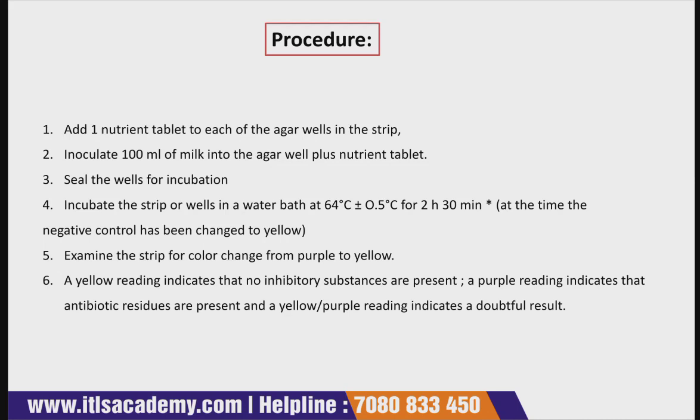Then after sealing and setting for incubation, you incubate the strip or well in the water bath. What should be the temperature? 64 plus minus 0.5 degrees centigrade for 2 hours 30 minutes. At that time the negative control has changed to yellow. Now we will see what the result is.